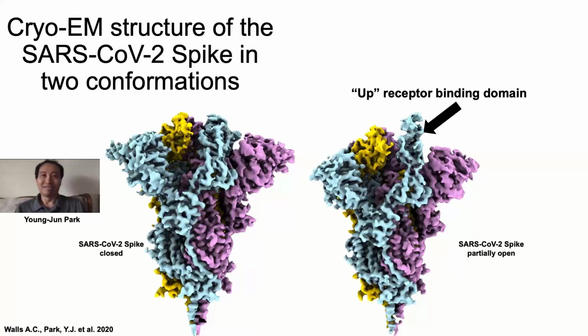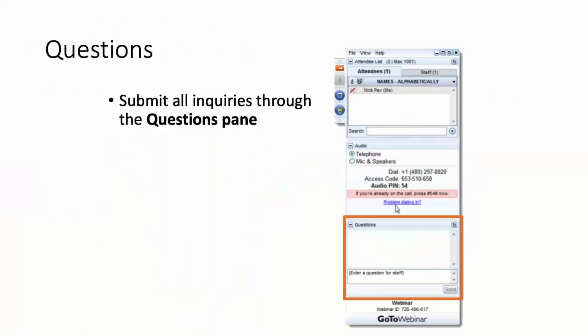Okay, I think there's a question about Latitude, so I'm going to be answering that. Is Latitude compatible with JEOL microscopes? Yes, Latitude S and T are compatible with JEOL cryo-ARM systems, 200 and 300 kV, and Latitude is compatible with almost all FEI microscopes as well.